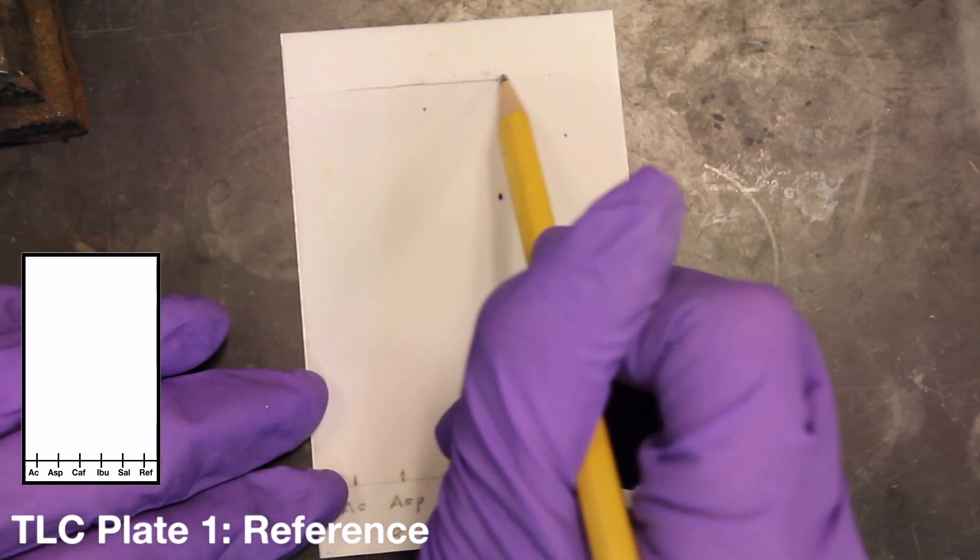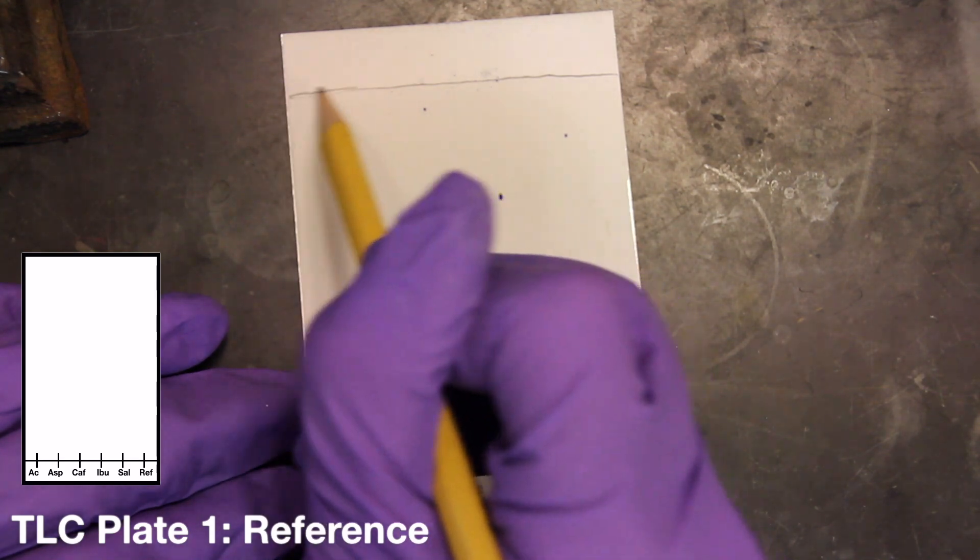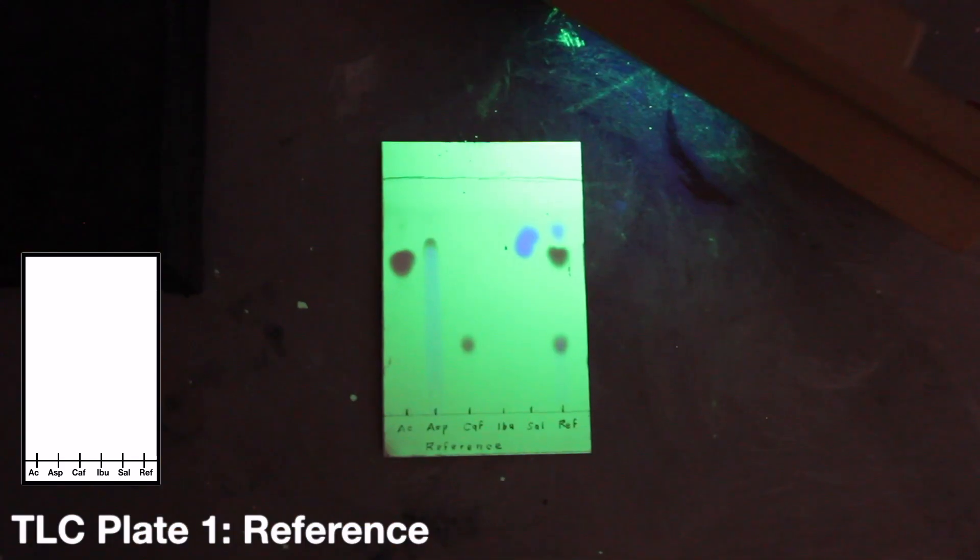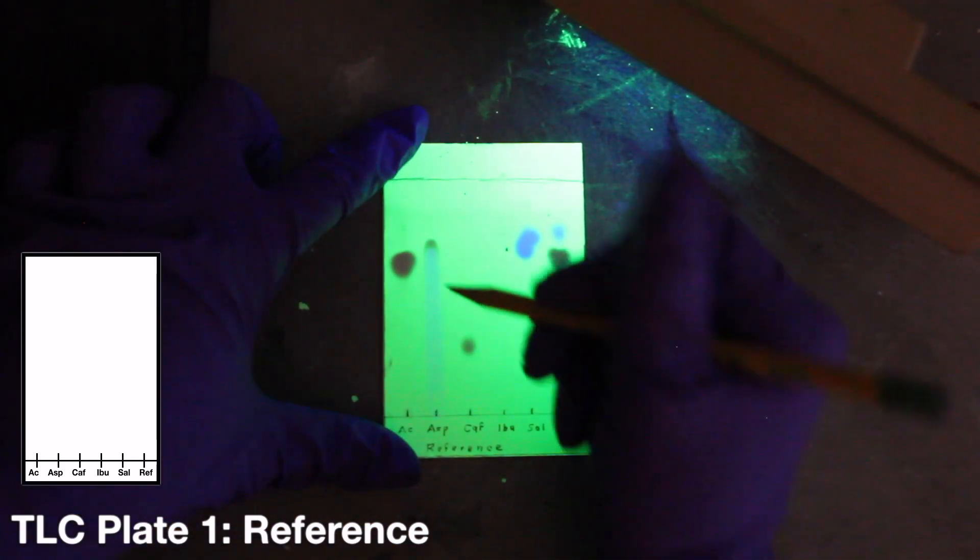Next, allow a few minutes for the plate to dry. After your plate has dried, observe it under a short wavelength UV lamp at the station set up in the lab prep room. Lightly outline all of the observed spots with pencil.